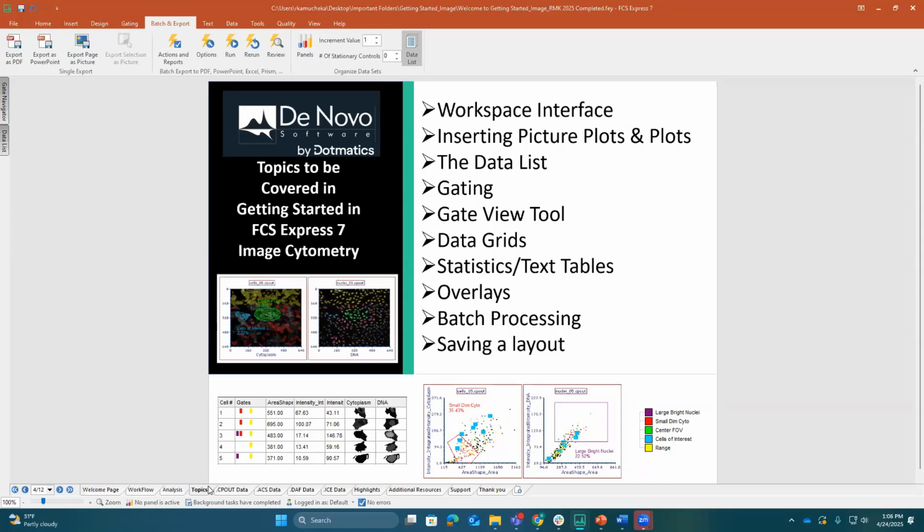One thing that's amazing about FCS Express is once I have created a workspace or a layout, we can create it as a template. So all I have to do is bring in new data and reuse old plots and things. It will update with the new data, move things around, and report them out. So it really can be an efficient and effective way to do your analysis. Now let's move into some analysis.